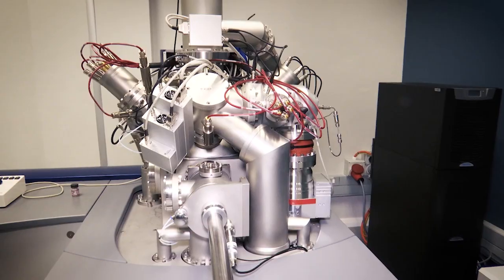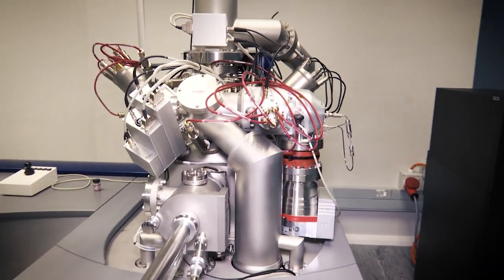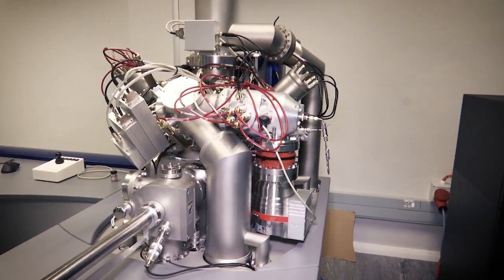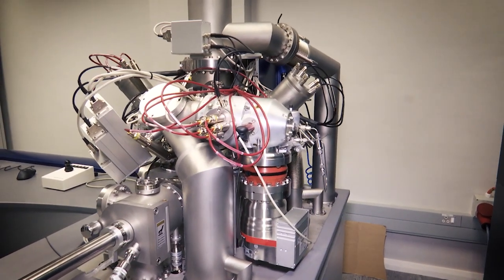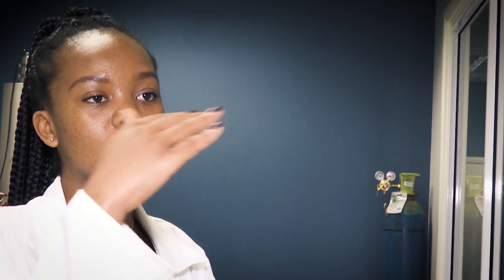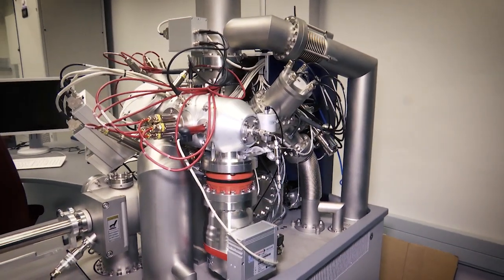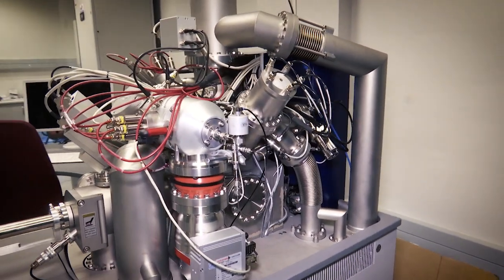This is the machine that we use. It's one of the very few in the world. We use this instrument to look at what the nanomaterials are composed of. You want to look at the layers and what chemicals make up each layer of the nanomaterial that you're using.